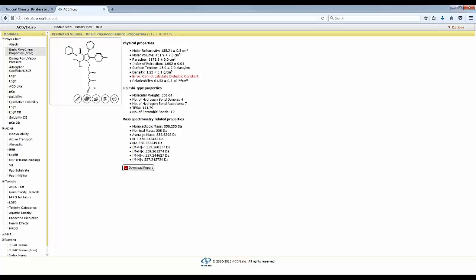Now, if you want to have a different training database with compounds that you are working with and are not commonly known yet, then, again, you will have to get the Benchtop software. And there you have the option of generating training datasets, training databases and libraries with your compounds that will not be distributed to anybody. So whatever compound is used in the library can be disclosed.